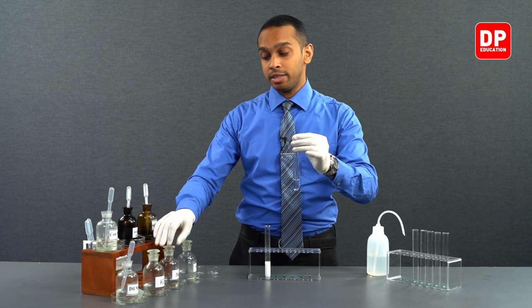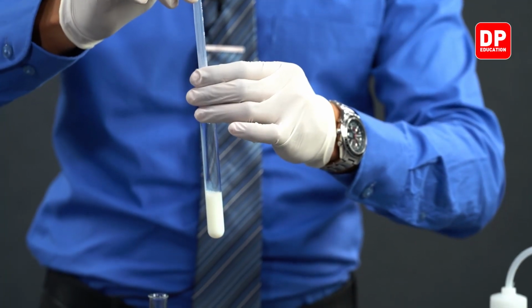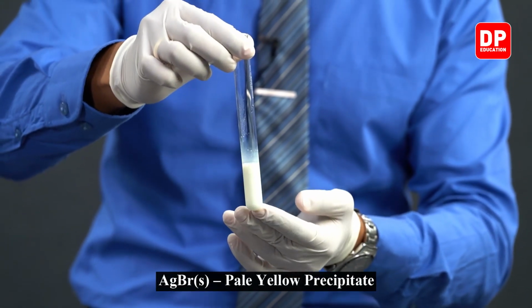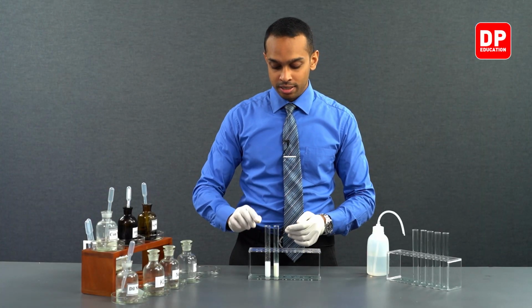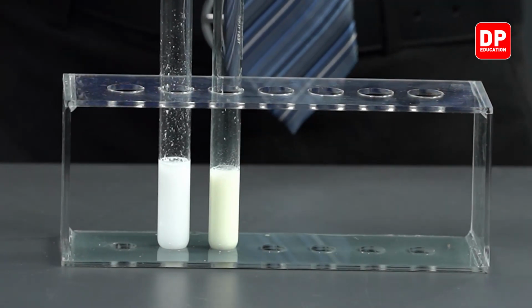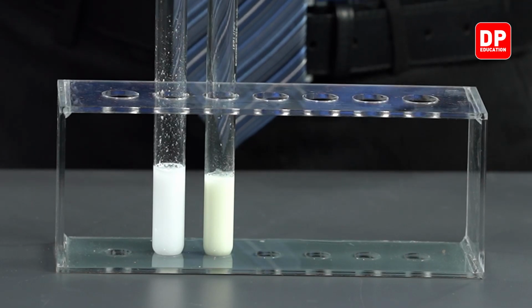To this sodium bromide solution, let's add a little bit of silver nitrate. We can see a pale yellow precipitate forming. Once you compare it against the silver chloride precipitate, we can see the slight yellow color of sodium bromide reacting with silver nitrate, forming silver bromide.